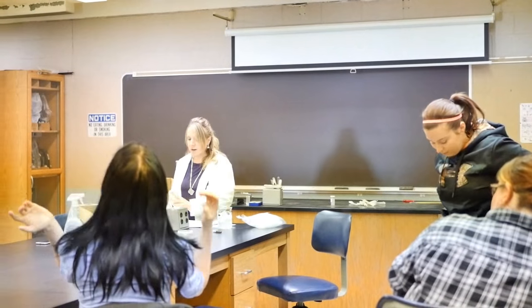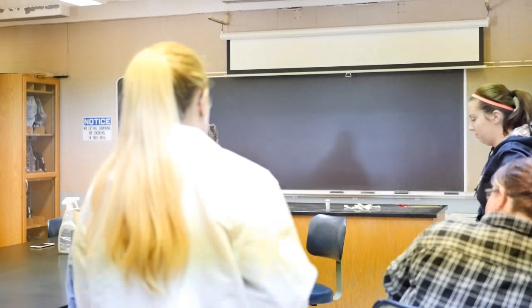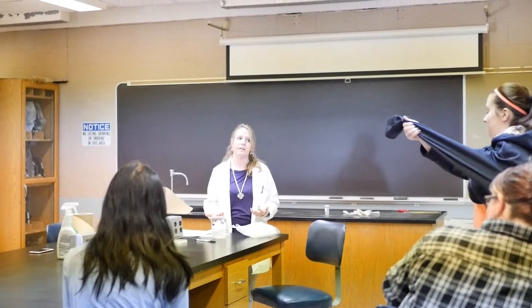So what we're doing today, just to give you a little bit of background, is a simple genetic engineering transformation. What that basically means is that we are giving a gene to a bacteria that this gene doesn't normally belong to. It belongs to a different type of bacteria.